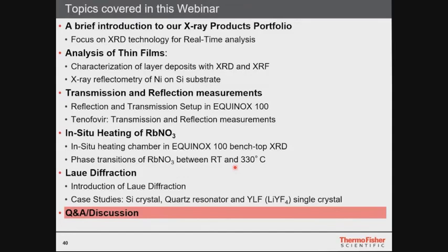And so it's also very important to see that when we emphasize so much on the benchtop instruments that Simon presented today, it is also to make them economically viable for the majority of laboratories alongside an FTIR or a Raman or a small benchtop EDXRF type instrument. So that's also very important, that there is no single technique that gives the absolute truth. It's always a combination of multiple techniques that makes material characterization complete.